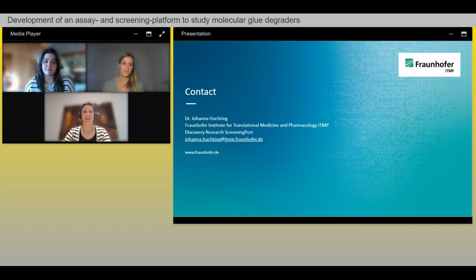So I can give it a go and start, and Melanie, you can add if you like. What we see, as I've shown also in the presentation of this webinar, is you really need to make sure that you're within the linear range with your cell numbers. So seeding cell titration is important because it really differs from target to target, from model to model. You have to be sure where you're at in that linear range. And then you need to have, I would say, a potent positive control to be able to calibrate your parameters and be sure of what you're seeing.